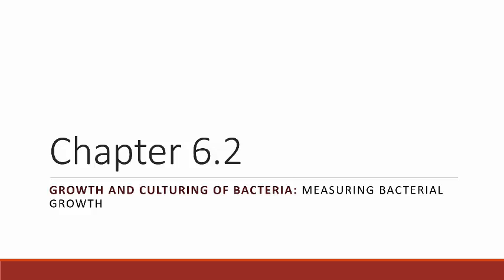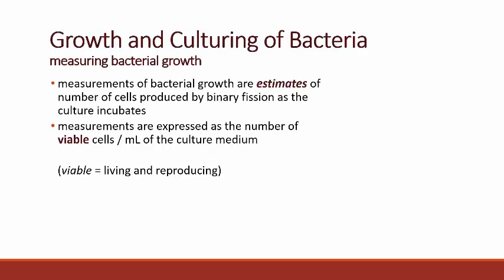So this video will be all about how we measure the number of bacteria that are growing in a culture. And first thing you should know is that these numbers are always going to be estimates. There's just no way that we can count the trillions of cells that are found growing in a culture as it incubates. And so all of these are about estimating, so doing the best possible mechanism for coming up with the number of bacteria that are in a culture.